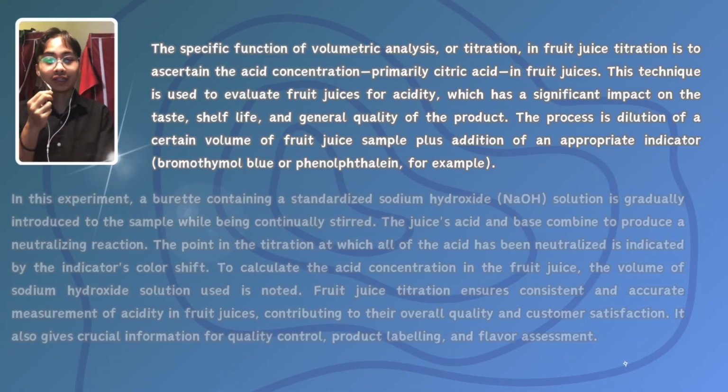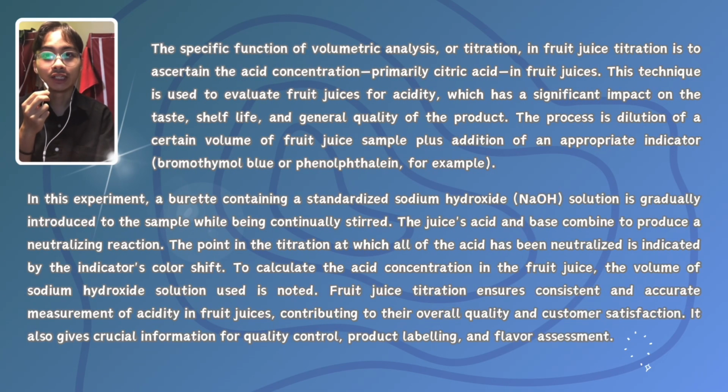Right, so last but not least, we move to the conclusion. So the specific function of volumetric analysis or titration in fruit juice titration is to ascertain the acid concentration, primarily citric acid, in fruit juice. This technique is used to evaluate fruit juices for acidity, which has a significant impact on the taste, shelf life, and general quality of the product.